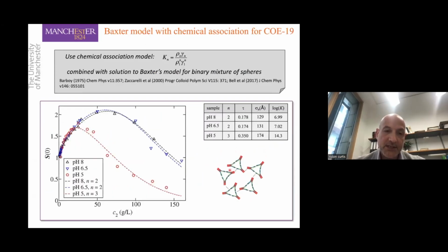And so in this case, we used a relatively simple approach to understand the behavior of the other antibody. What we did is we just postulated the existence of dimers or trimers. And then we just fit a multi-component model for our osmotic pressure to the data. So we say that we are forming dimers or trimers, and that we have sticky interactions that occur between all the components in the system. And we can calculate the activity.